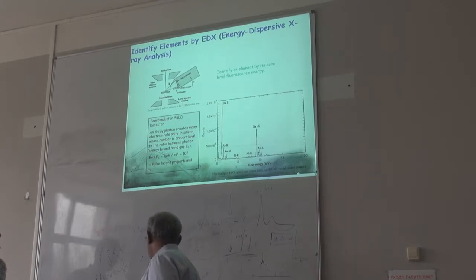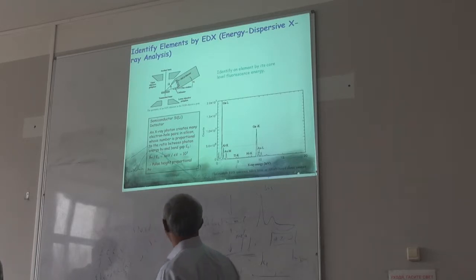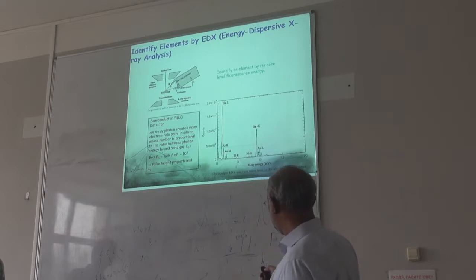Sometimes they call it EDAX, sometimes EDS, different names. This is energy dispersive spectroscopy. So this is actually X-ray based.